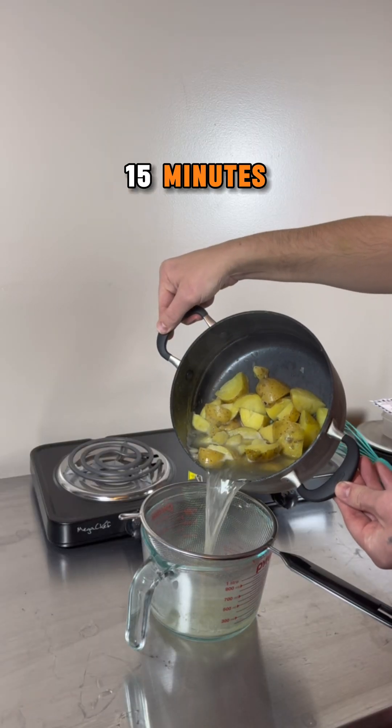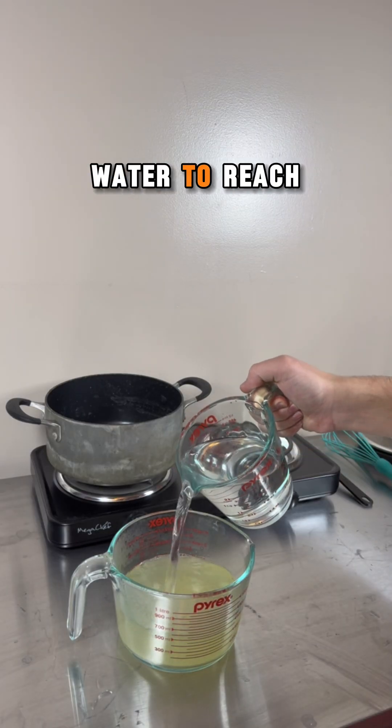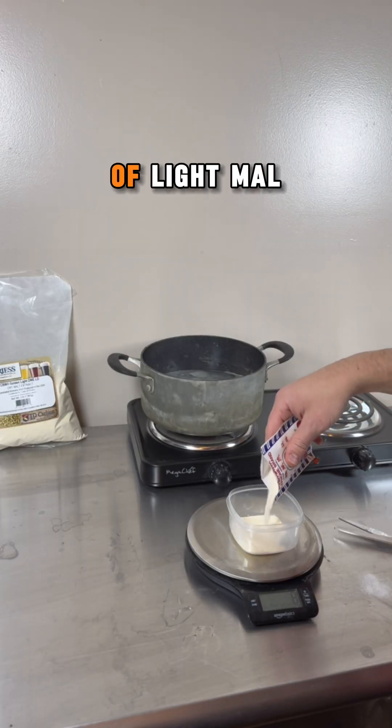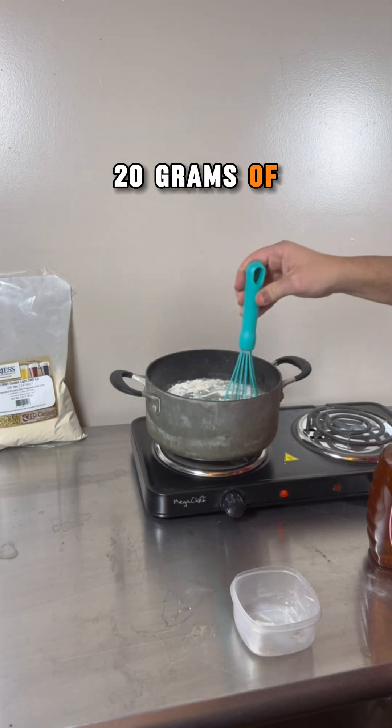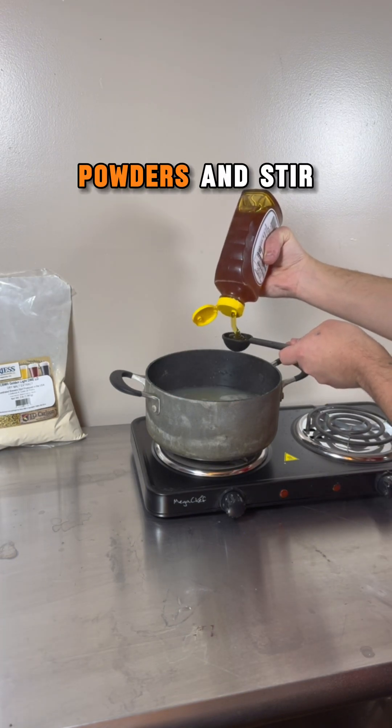I boil the potatoes for 15 minutes. Once the potatoes are soft, the liquid is strained, diluted with distilled water to reach 1000 milliliters, and then poured back into the pot. Next, I weigh out eight grams of light malt extract and 20 grams of agar agar powder.